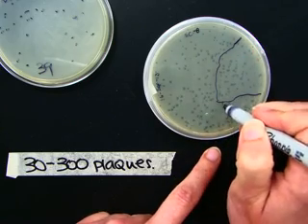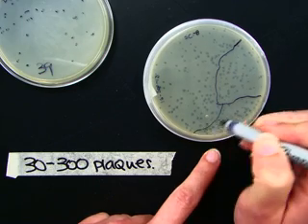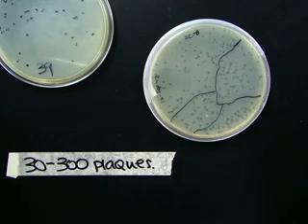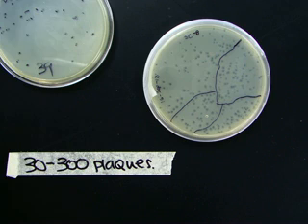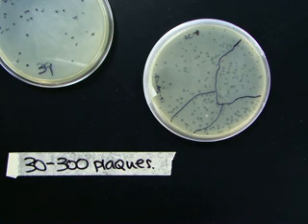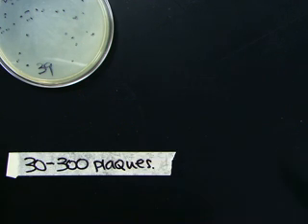Maybe that section, maybe that section, and so on. And then you can count within each section using the dot technique, and then add all of your section totals together, and it will really decrease both your error and the time that you spend recounting if you get lost on the plate. So that's the way that I recommend you to count the plate.